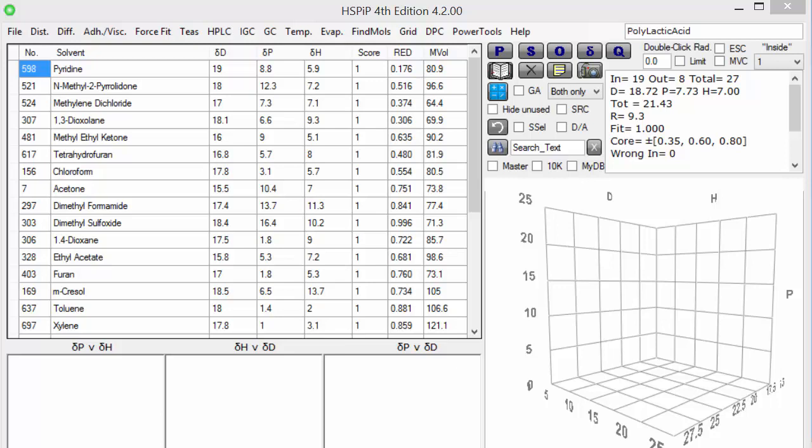A much more powerful way to think about molecules is via HSP, Hansen solubility parameters, and using the HSPIP software which I have here makes it very easy to explore the whole of HSP space. Here I want to show you a better way to describe the essence of a molecule using the three HSP parameters: DD, DP, and DH.